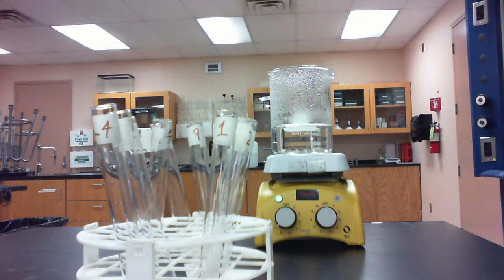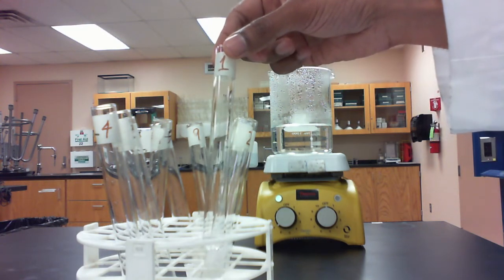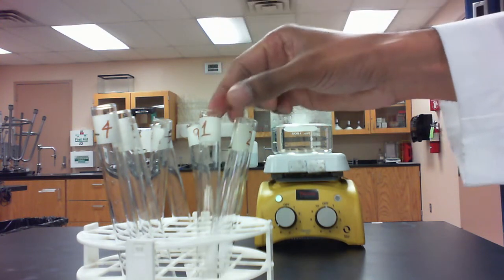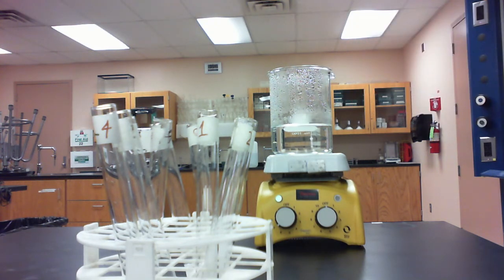All right, and after we've added that third component, the acid catalyst, we're going to place our test tubes for about 5 minutes in our boiling water bath, which is right here. And after 5 minutes, we're going to take them out, let them cool down a little bit, and detect the scent in the test tubes.